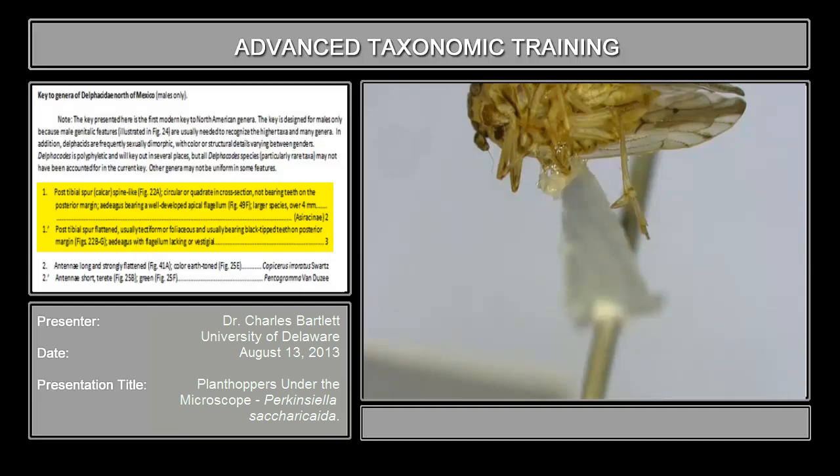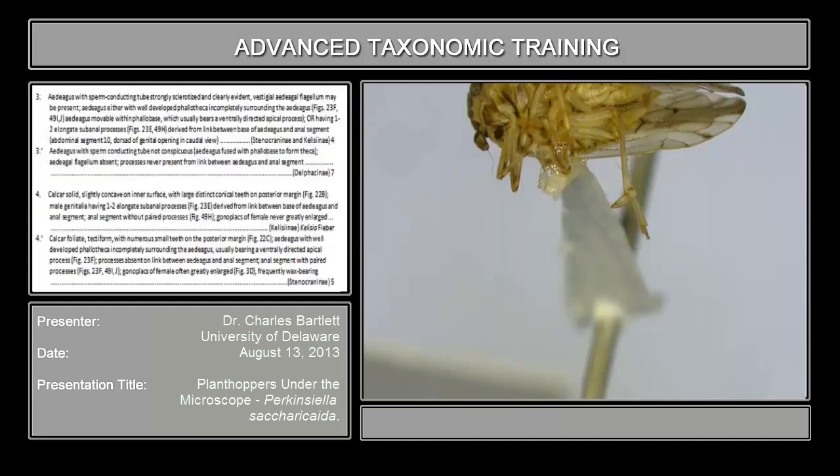It also bears a row of teeth on the posterior margin. And that is what you're going to expect to see essentially all the time in interceptions. If you see anything else, then you have something interesting, or you've got one of a small number of taxa of Delphacini that, for whatever reason, lack those teeth. So with that, we go to couplet three. There are only two species in North America that have a spine-like spur.